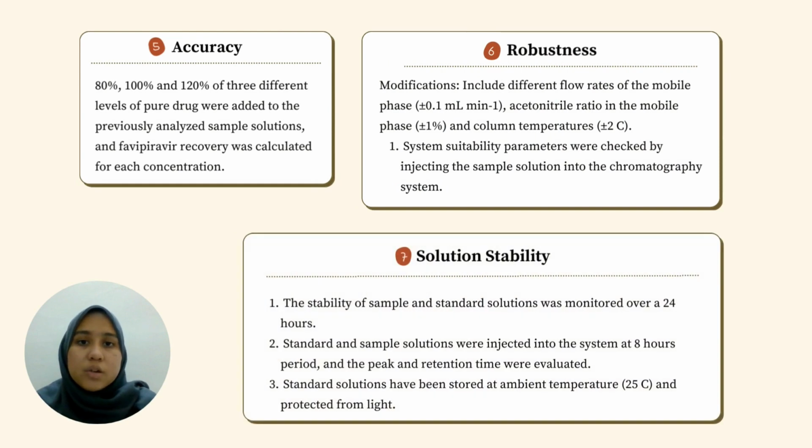Next, we move on to accuracy. In this method, 80%, 100% and 120% of 3 different levels of pure drug were added to the previously analyzed sample solution. And favipiravir recovery was calculated for each concentration.